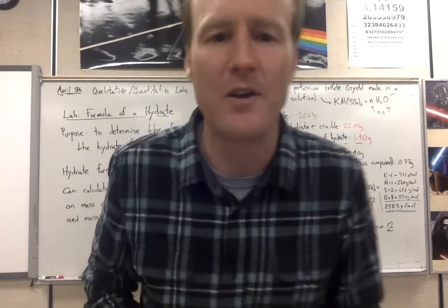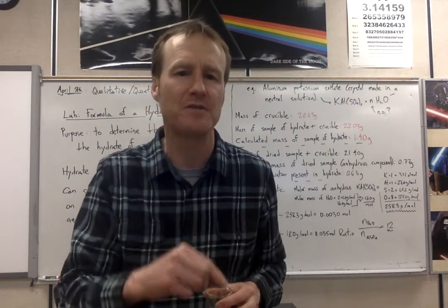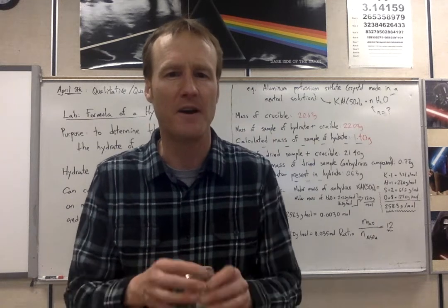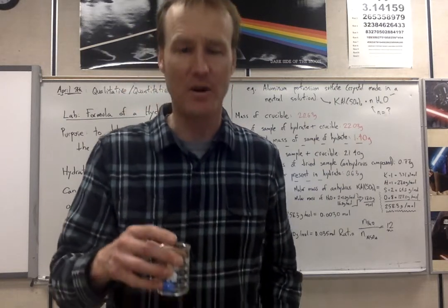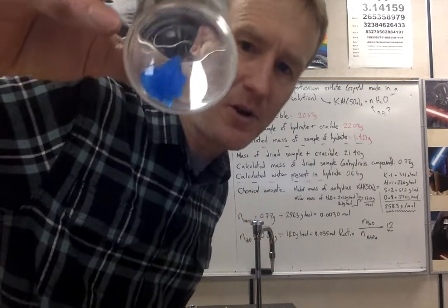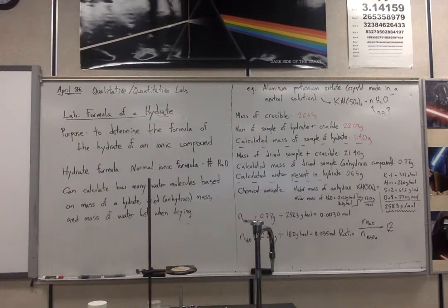Why do you think, by the way, I chose a big crystal instead of a bunch of tiny crystals? That can be some food for thought for you. Why did I find the biggest crystal I possibly could to do this lab activity? That's going to come up in the question set. I'd like you first of all to see the color of this crystal. There's a nice close-up for you. It's a very large crystal of copper sulfate.